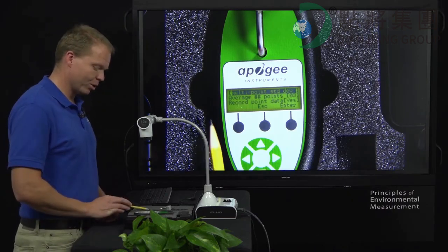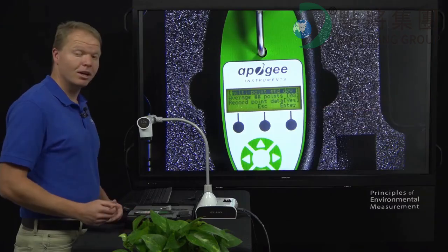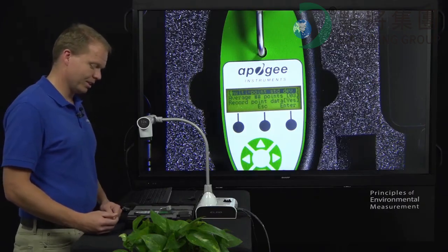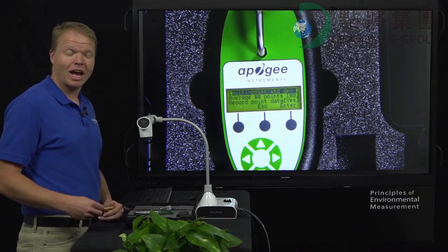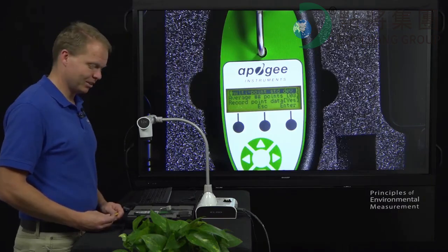Now, on this last one, record point data, if you have this in no, right here, then it means that it is only going to save your standard deviations, your average standard deviation. If it's in yes, it's going to save every individual point as you measure, as well as that, it's going to save your average standard deviations.